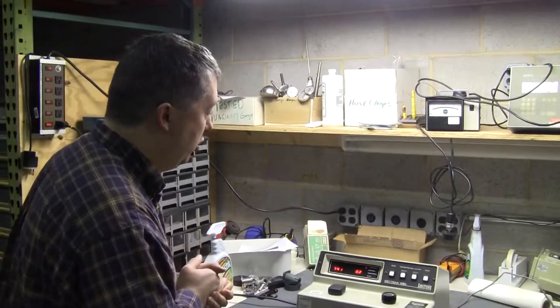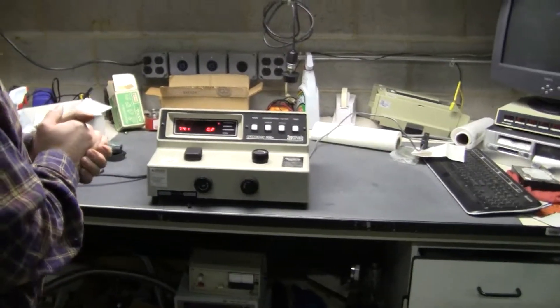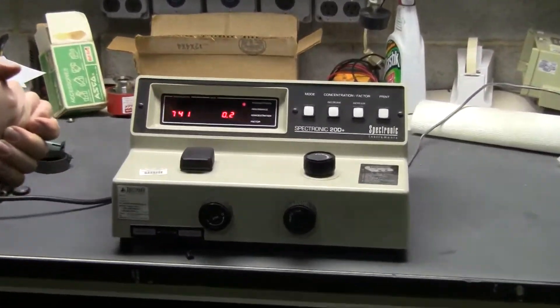Hi, this is Michael Mateo once again. Today we're looking at a Spectronic 20D+, the digital version of the old classic Spec 20.